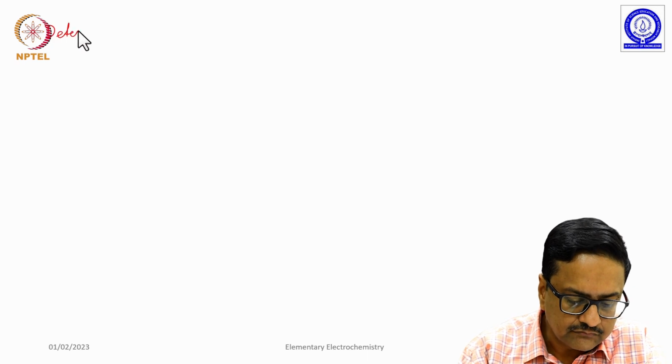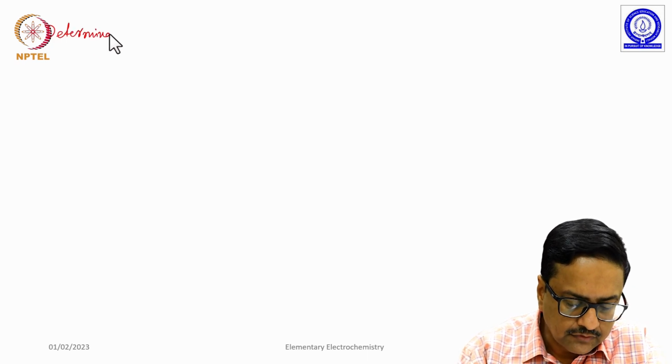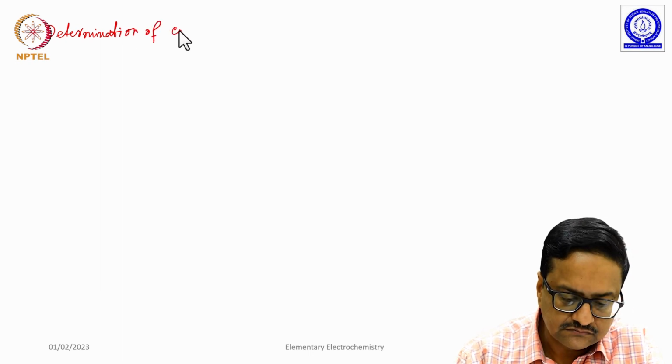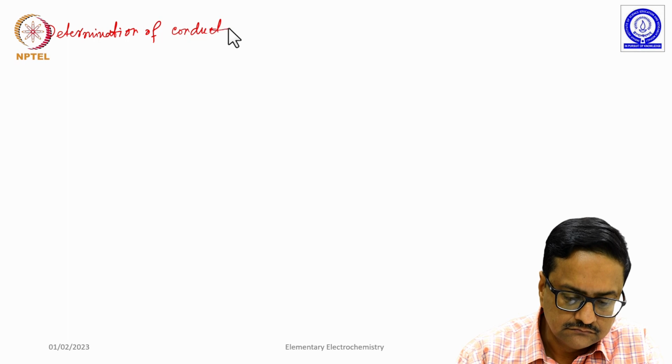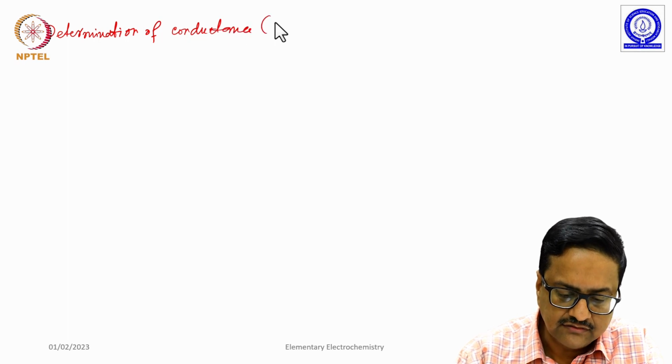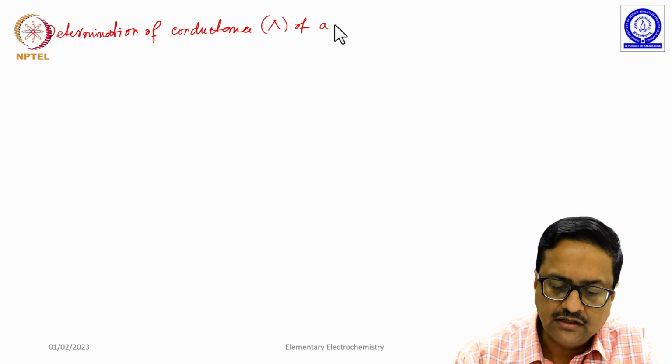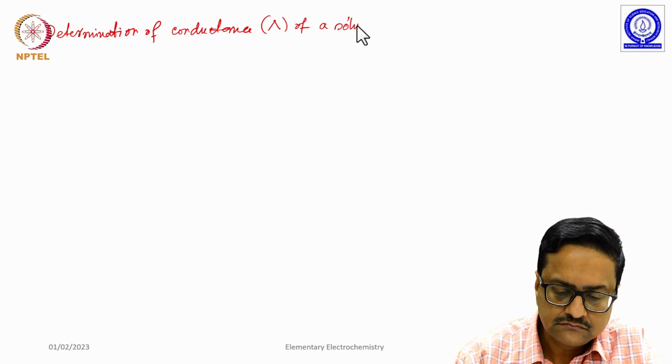determination of conductance, that is lambda of a solution of an electrolyte.